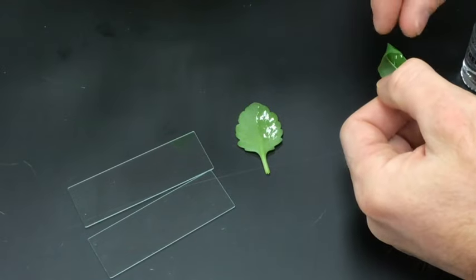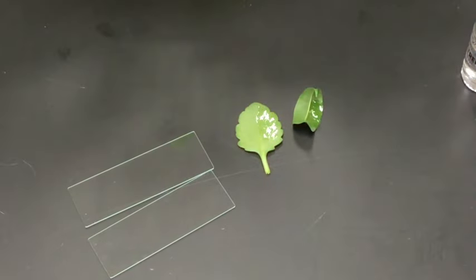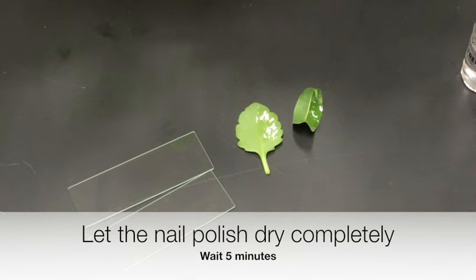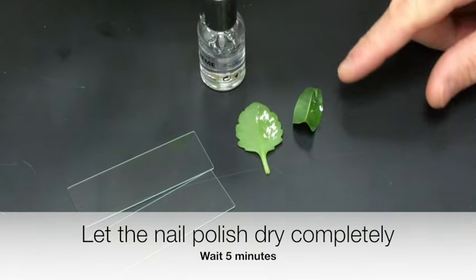Now this will only work if the nail polish dries, and so depending on the conditions, if it's humid or not in the room, that kind of thing, you might have to wait a while. I'm going to say, let's just go five minutes.